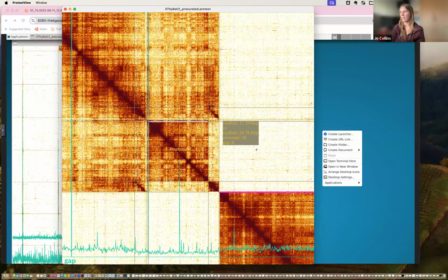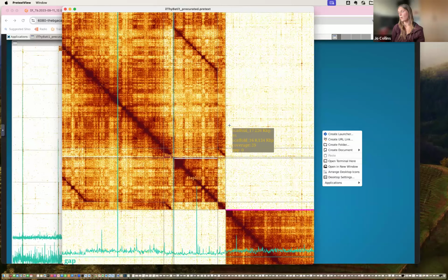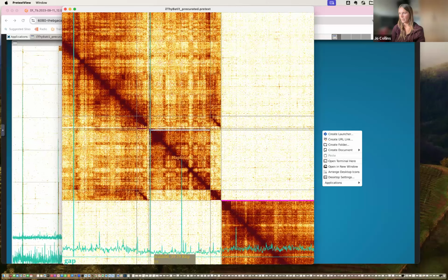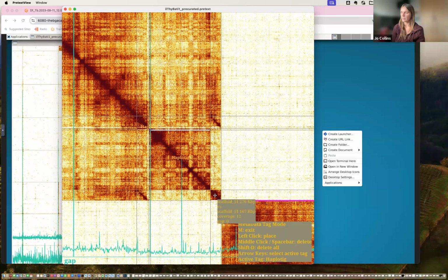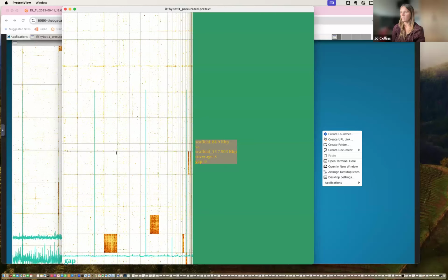Sometimes it's possible to tell. Some of the assemblies that we look at, there's a really strong sort of haplotype bias. You can sort of piece together things by haplotype. Where the autoassembler hasn't done such a good job, it's possible to manually phase assemblies. But in this case, I've just taken the longest copy. And again, you can see the coverage on here is another indicator that it just gives you good evidence for showing that it's the haplotype. I think that's all of that.